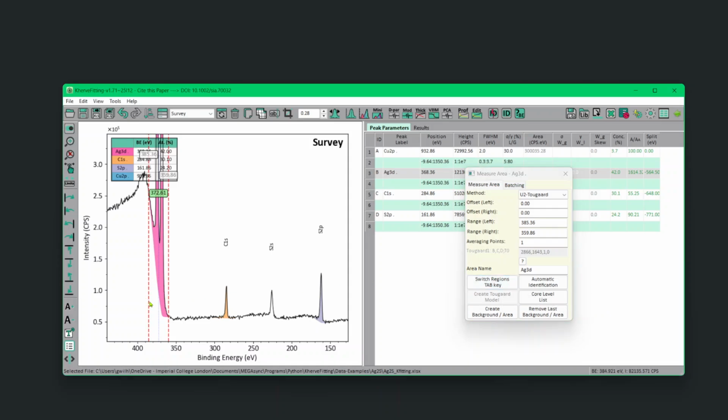Now if I try to move it, you see it's just coming to the center. It's not moving, so I can't change the width. I want to go up to here. Again, if I just go there, you see it's not helping me. But you can just start from there and move slowly here. And then the same here. It's not going to work. So I'm going to go from here and then just go down there. Okay, so this should be a good level for Shirley.